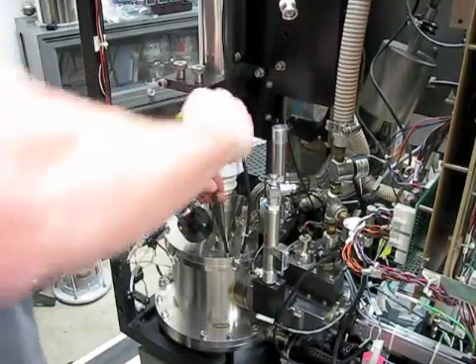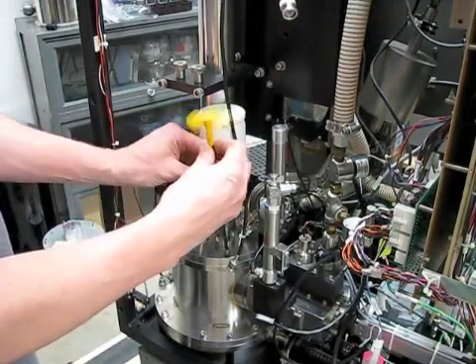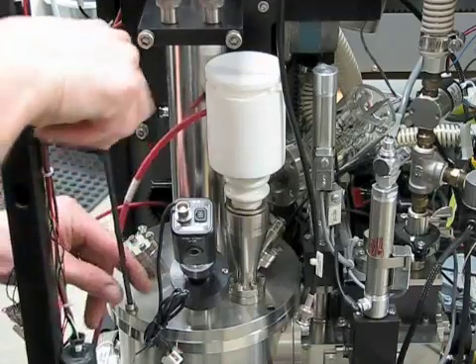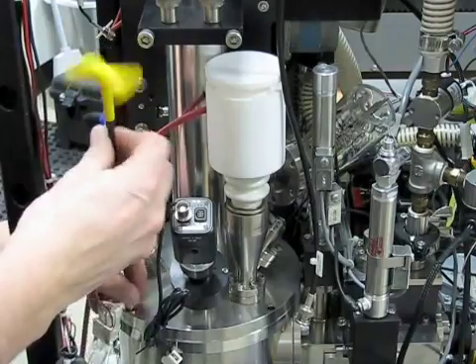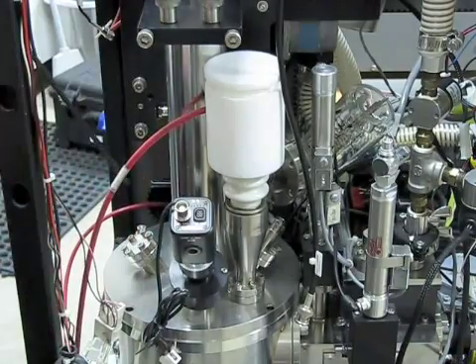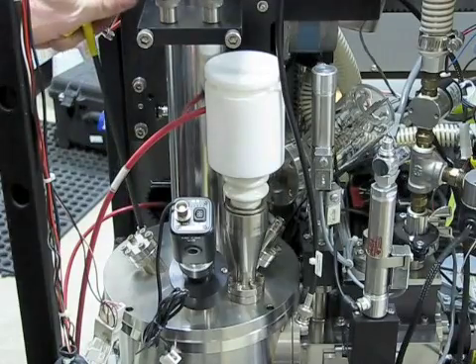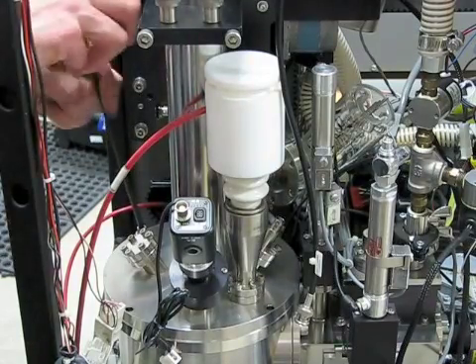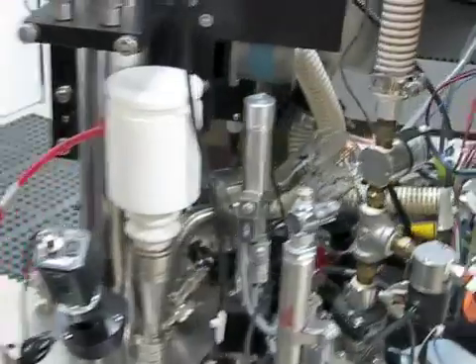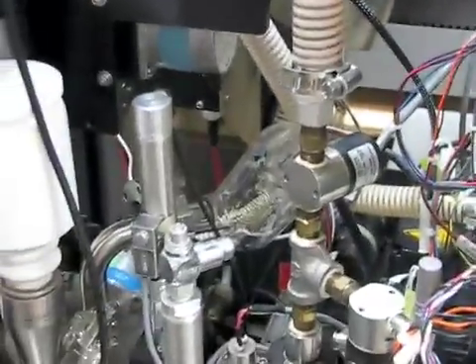Now use the 3/16ths T-handled Allen wrench to remove the 4 hex head screws securing the flight tube to the source chamber. The red high voltage wire shown right near that cable will also need to be removed from the power supply and from the DE switch box — that part is not shown in this video.